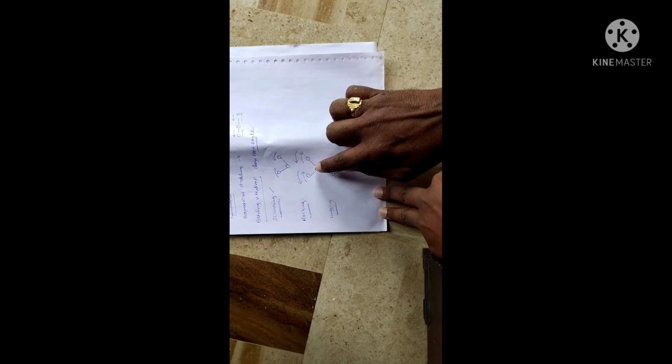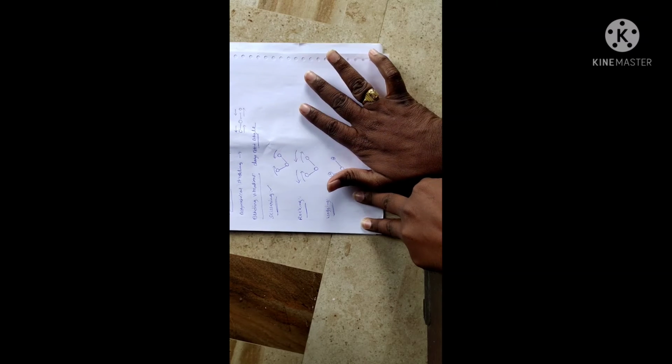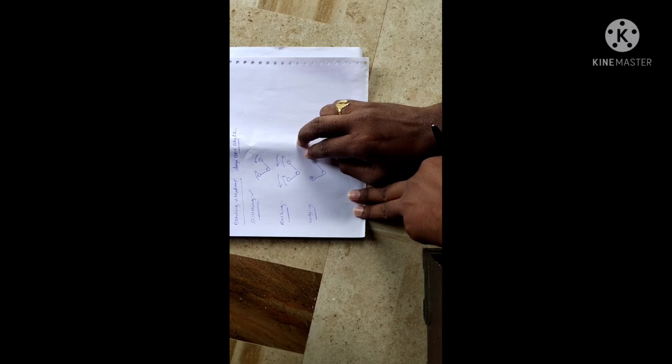In the previous ones, they are in the same plane only, moving either in the scissor mode or the same type. But here, wagging means out of plane bending vibrations.